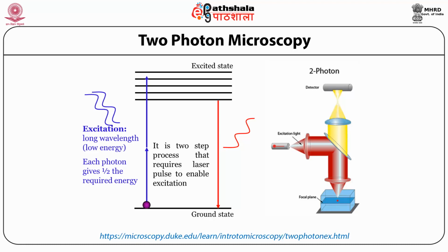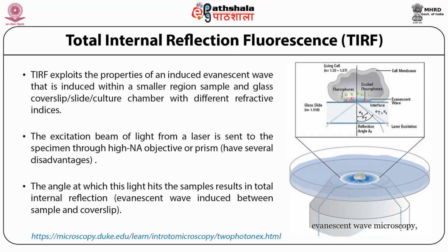The rest of the principle is the same, but here, as you can see in this specimen, the specimen is thicker, the focal plane can be way below, and the signal distribution can be separated in a thick sample. But because we know exactly where we are exciting, we can exactly figure out where the signal is coming from.